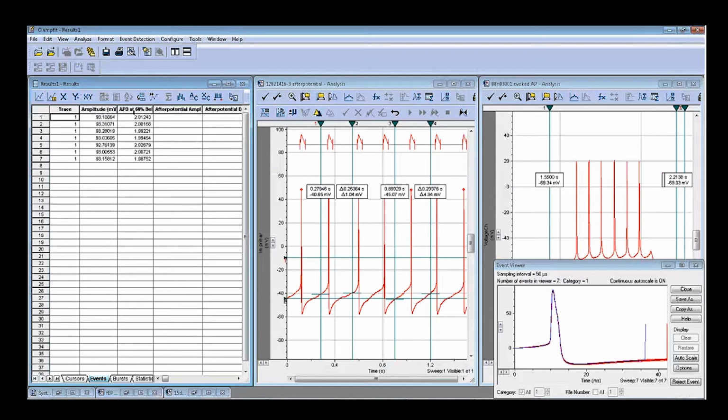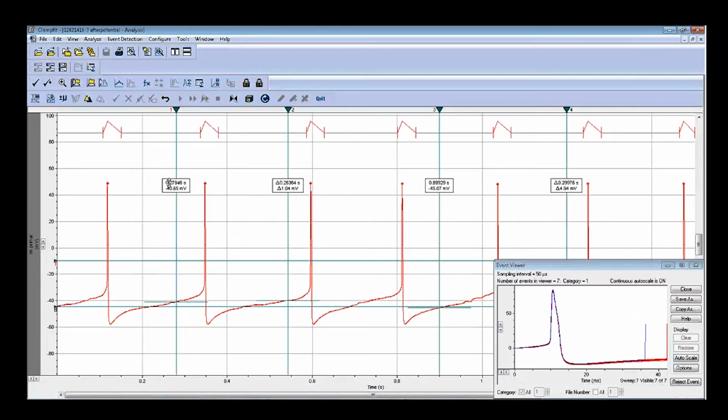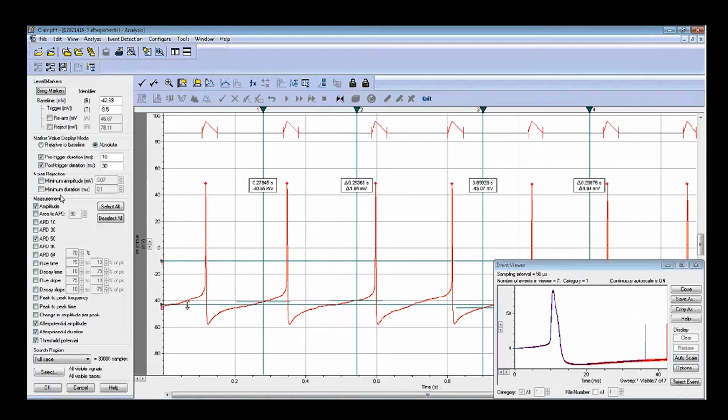Now the amplitude, we have this one. If we don't get this one, let me do one more time. Maybe I need to do some fine tuning sometime. Okay, let's go back to here. I did that. Oh, I see why that's not working, because you can see here, I should make this longer. Because the event duration is shorter than here, if I put 30, let me put 150. Now you will see that the data look different, right?